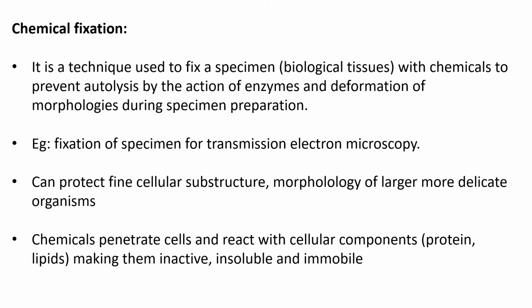So in this chemical fixation, what happens is that it can help protect the fine cellular substructure and morphology of larger, more delicate organisms, instead of just simply killing and completely denaturing them. The chemicals penetrate the cells and react with cellular components like proteins and lipids, making them inactive, insoluble, and immobile.